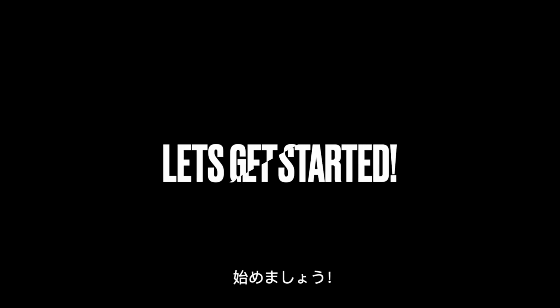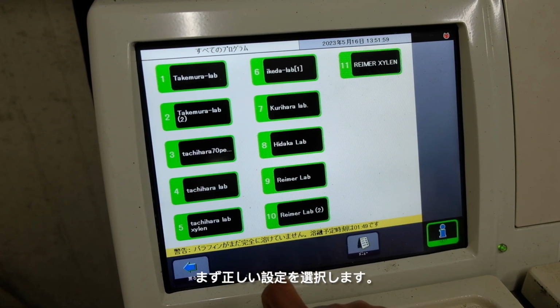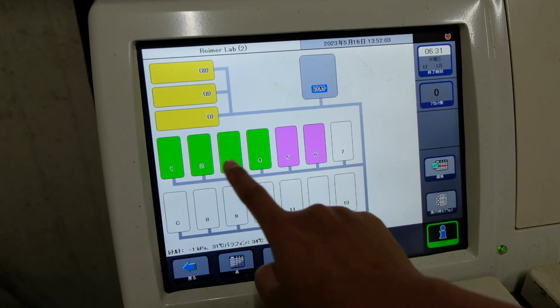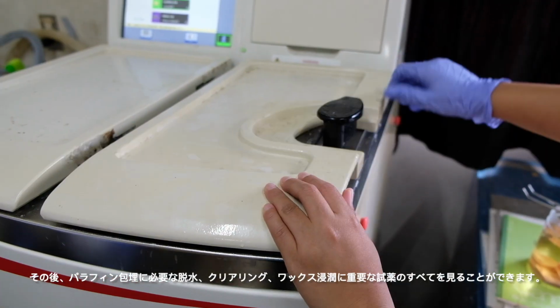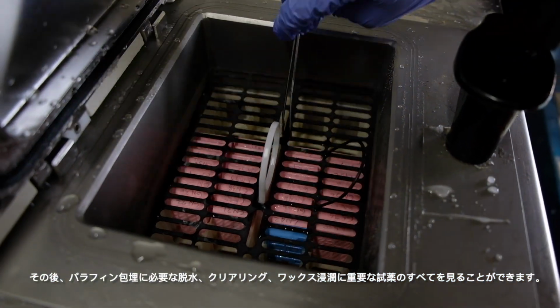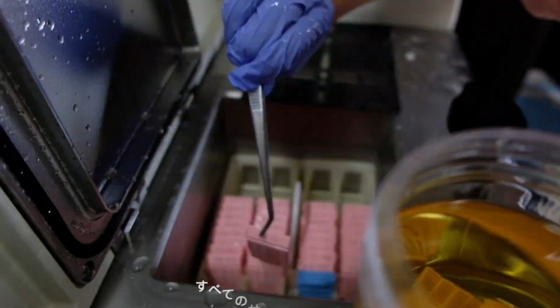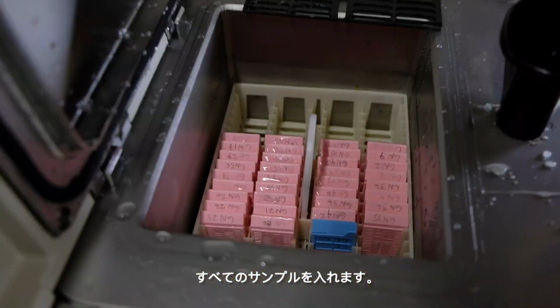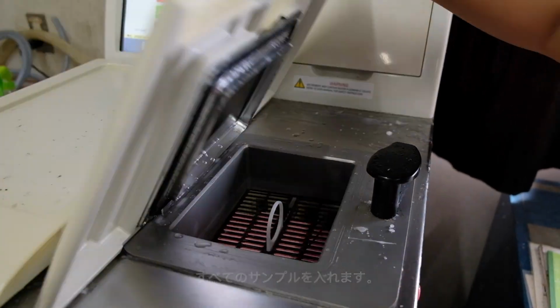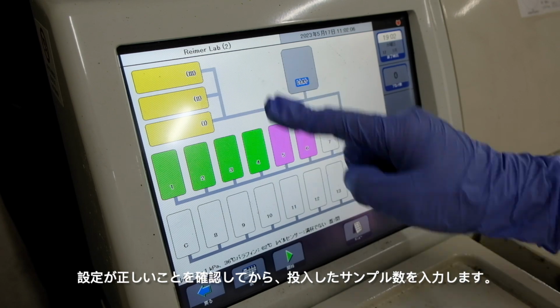So let's get started with this process using our samples. So first, make sure to select the right settings, and then you can look at all of the reagents in there, which is important for dehydration, clearing, and wax infiltration, to ready for paraffin embedding in the next step. And we can then start to put all of the cassettes in once the correct settings have been selected, and close it up.